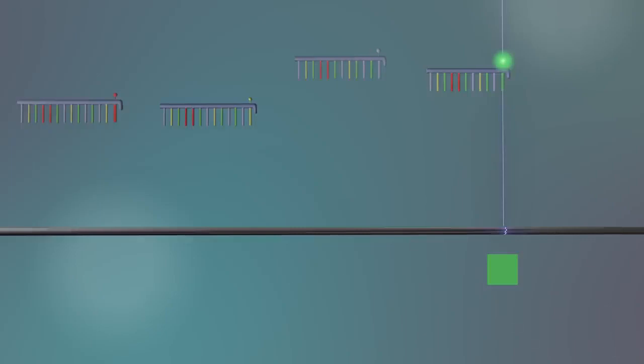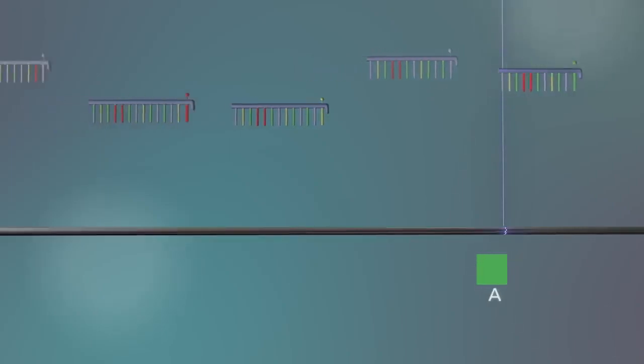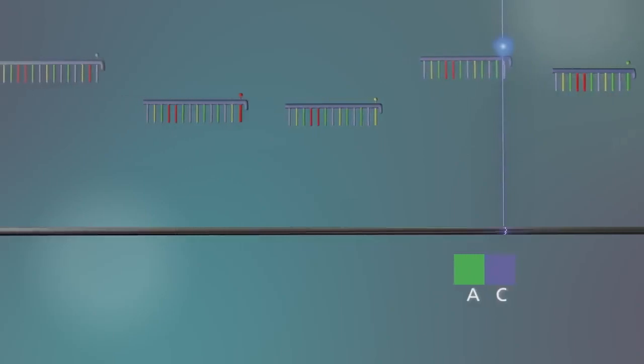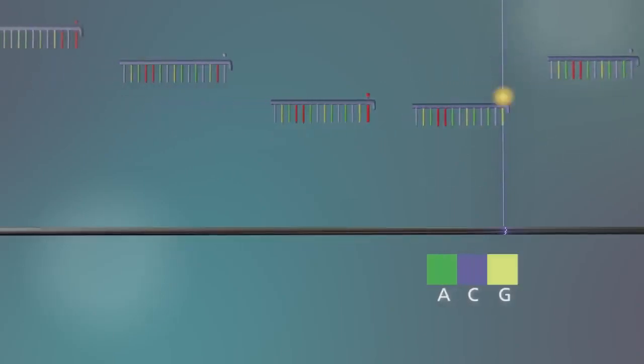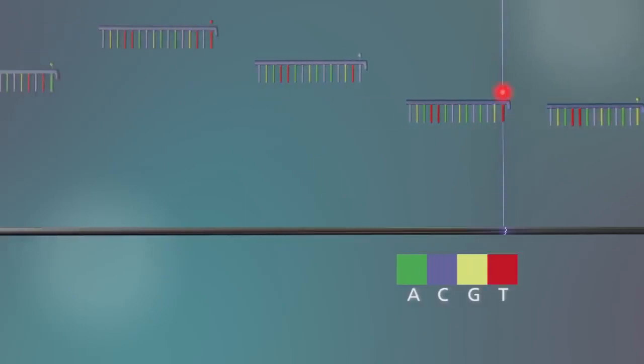Each terminator base is labelled with a different colour. A fluoresces green, C blue, G yellow and T red.